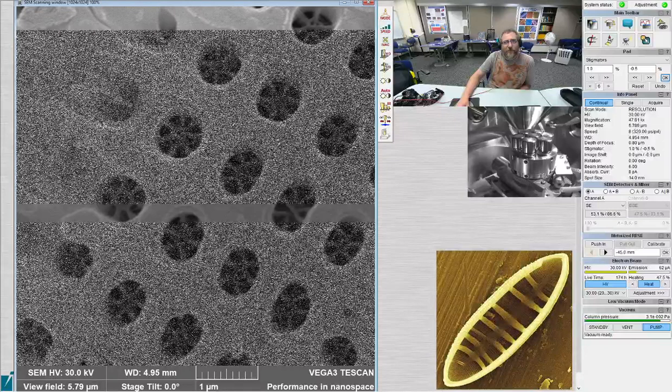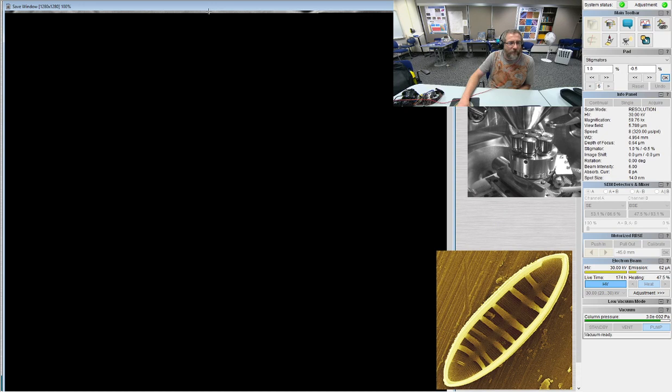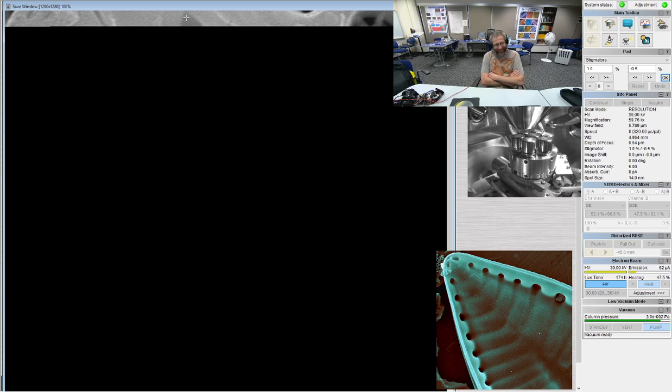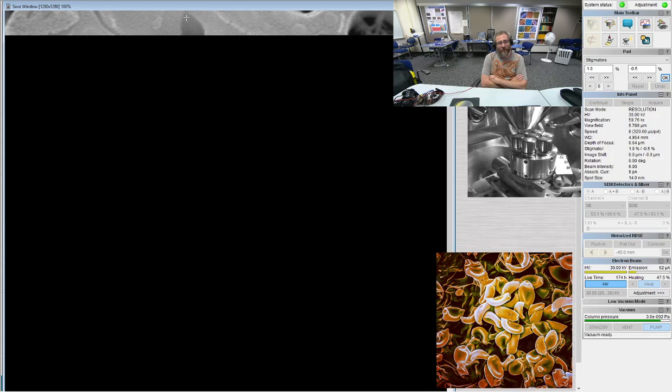Well, I'm just starting to think. So these pore coverings might, just wild ideas, no real evidence, but these could act as sort of a molecule sorting device, like a coin sorter. You know, put all the quarters to one side, all the dimes in the middle. I don't really know the size of a phosphate or a nitrate or things that would be important to start sorting. But if you give people something to Google, they'll Google it. That's what we do here.